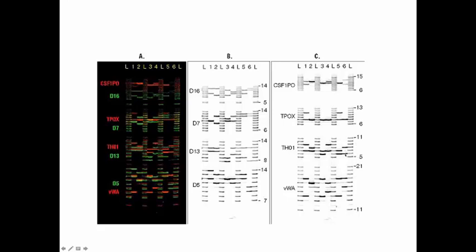And this is heterozygous. On the other hand, at TPOX, person number 6 would be put into the system as an 8, 8. So they only have a single band there, and they only have 8 repeats. So this means they inherited 8 repeats from their mother and 8 repeats from their father. Whereas here, they could have inherited a 6 from their mother and an 8 from their father, or an 8 from their mother and a 6 from their father. 2 different ways that could have occurred.